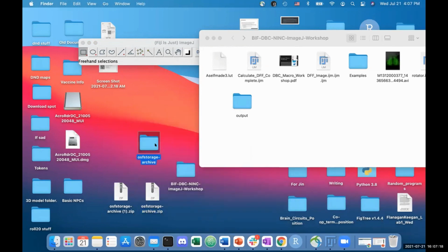Oh, I think I see what you're talking about, the extract. I do see an extract on the top of my file explorer for Windows. Okay. Yeah, like extract all. Yeah, try that first. Oh, okay. And then I think ImageJ will be able to navigate inside there and find the TIFF and open it for you. Okay, I think that will definitely solve the issue.